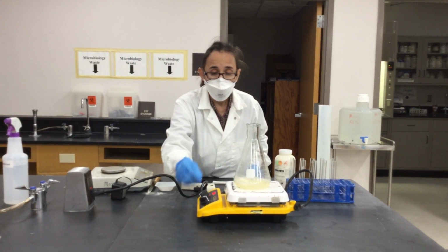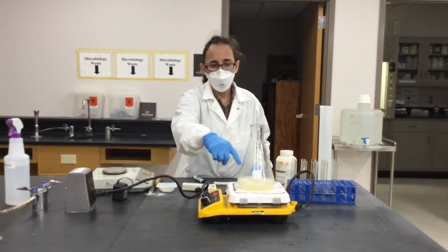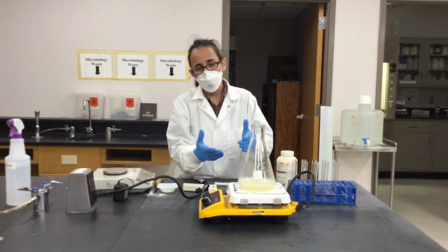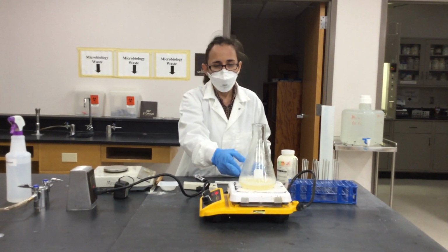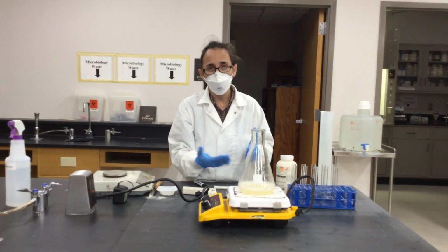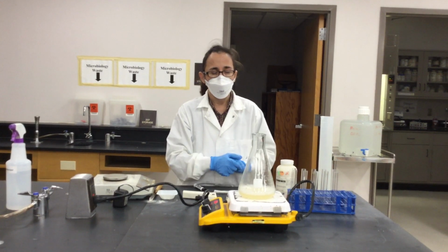So this process is going to take a while, and I cannot be recording that long, but if you see here, you can see how the media is getting stirred. And eventually, once I see a change in color as this agar is melting, instead of seeing this kind of cloudy color in the media, you will see a more transparent or translucent color, meaning that you have melted all the agar particles, and now it's going to be ready to be poured into these test tubes.